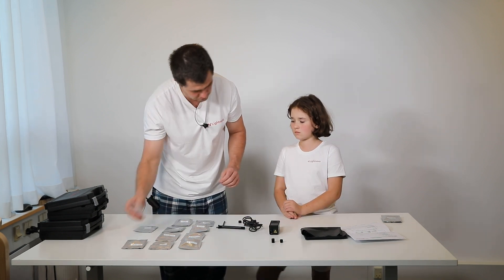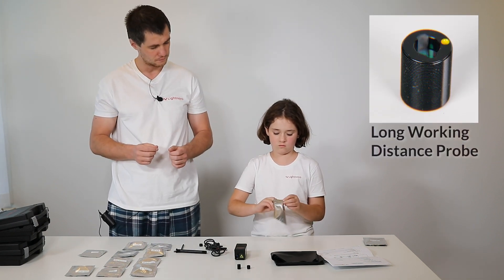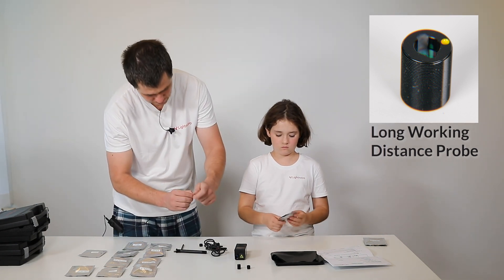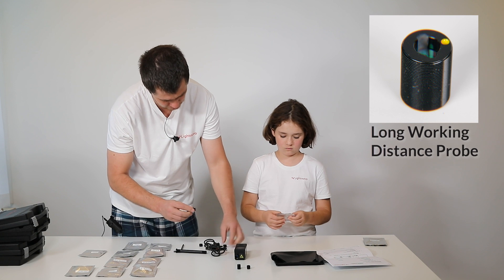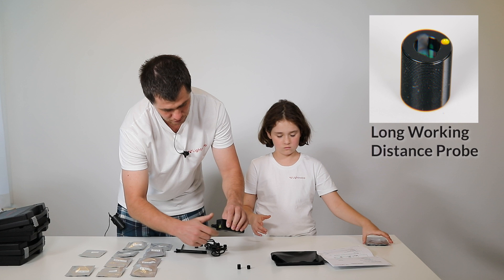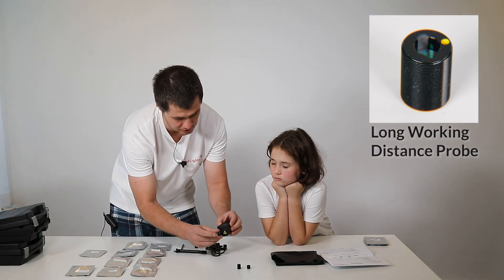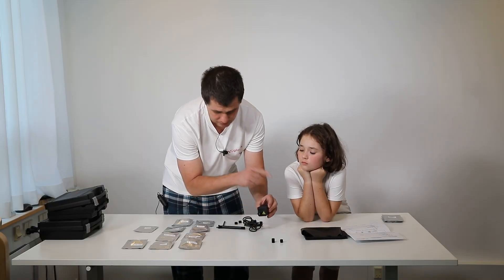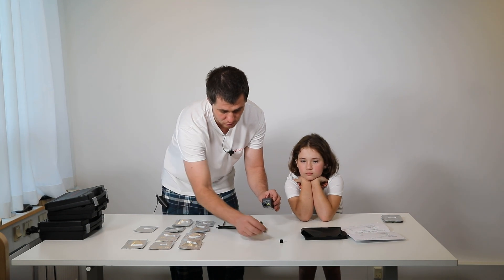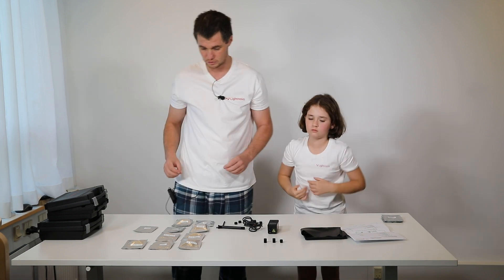Let me select for you the long working distance probe. It has caps and a yellow dot. The same way you just screw it and you're ready to go. Working distance here would be 25 millimeters — it's written on the box — and for the middle working distance it's 10 millimeters, also written on the box.